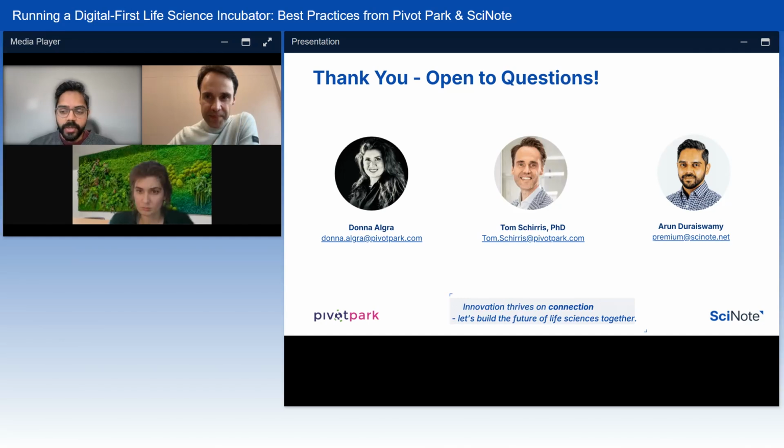Tom shared a lot about the shared inventory. How do you utilize the ELN part in the shared lab? Yeah, so I talked most about the inventories as that is something that we had to set up as the incubator management team, but I think that the ELN part is something where we really leave flexibility for our users. So I think they can set up their own ELN environment, to track laboratory notes with their own structure.